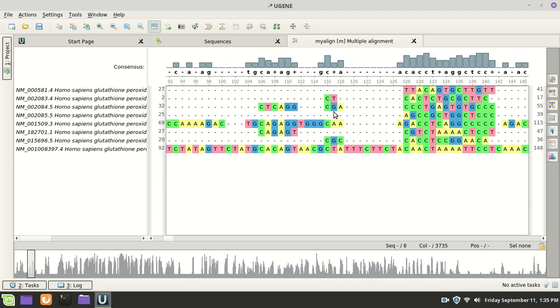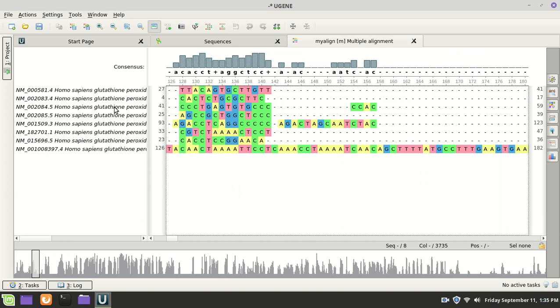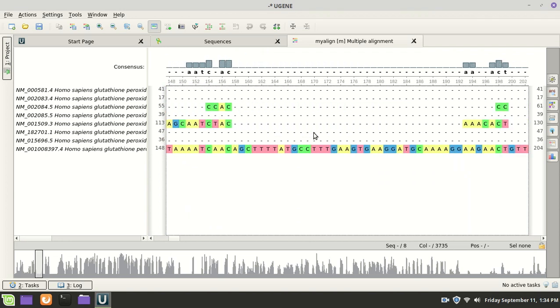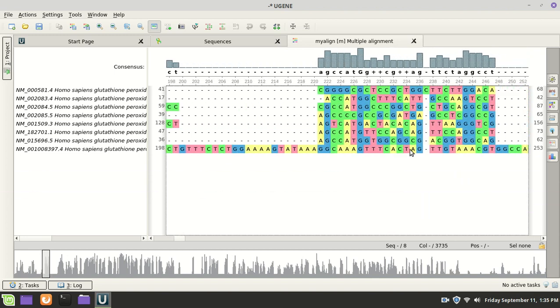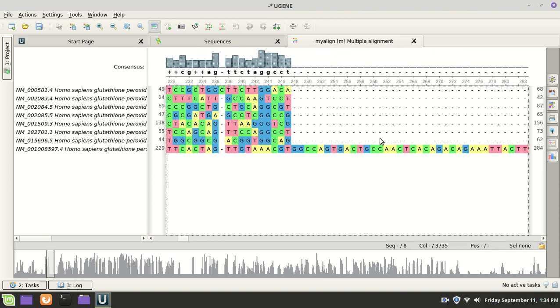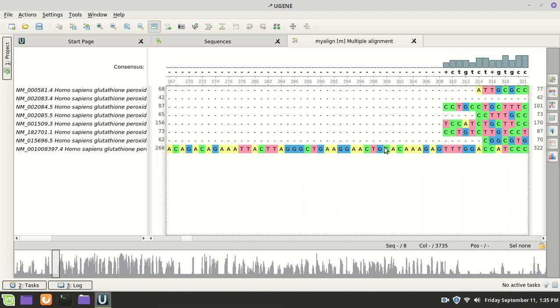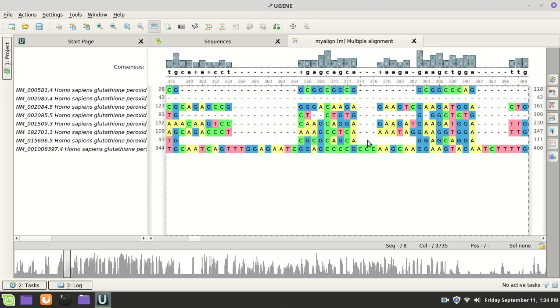But here's how it would alignment. It looks like there are pieces that align pretty well in these regions. This top one doesn't seem to be aligning well. One of them is obviously much longer than the other, it looks like. Here you have a gap. That's an interesting piece. But this is what this program says is the alignment for these pieces.